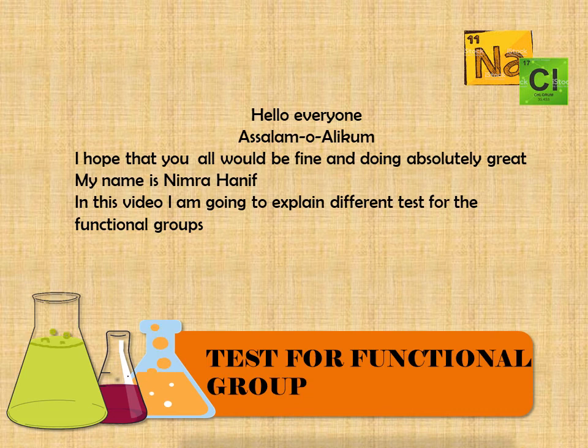In this video, I am going to explain different tests for the functional groups. So let's get straight into the topic.